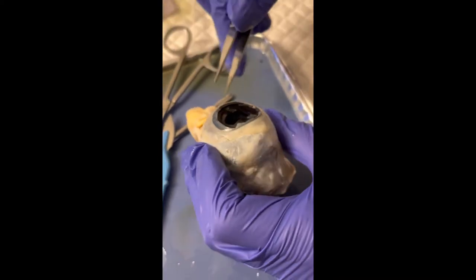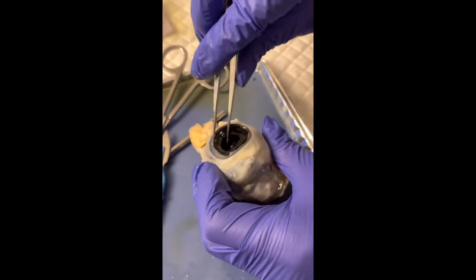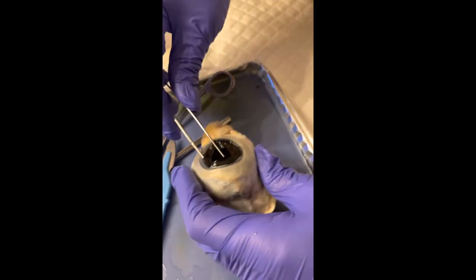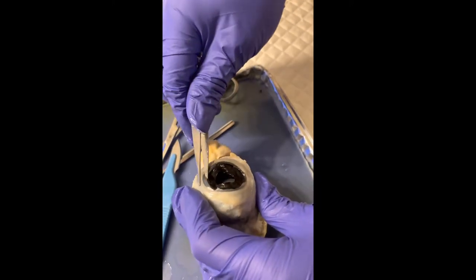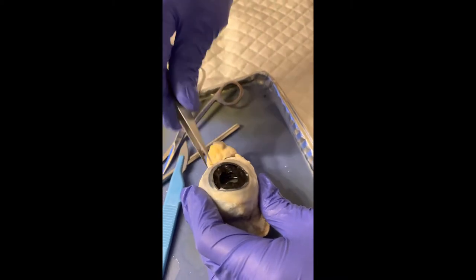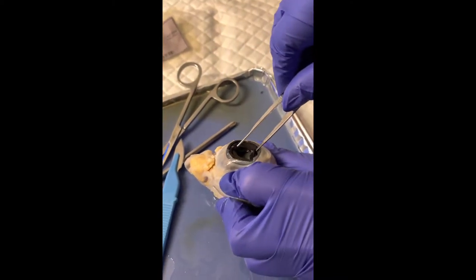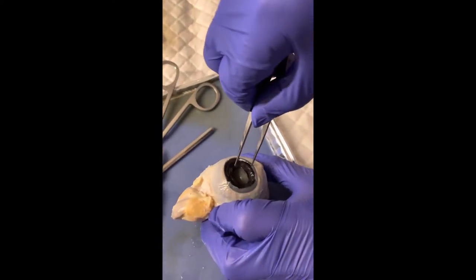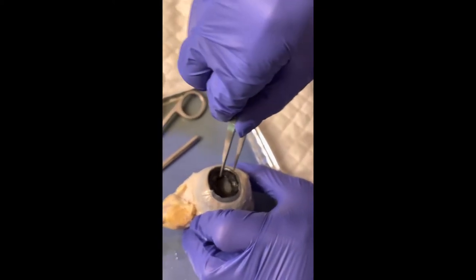My next incision began with removing the actual iris by gently pulling apart with tweezers. The iris was extremely fragile and I had to ensure my tug wasn't too fast, but just more like a wiggle out of place to ensure it didn't rip apart. I found it to be like almost removing contact lenses.